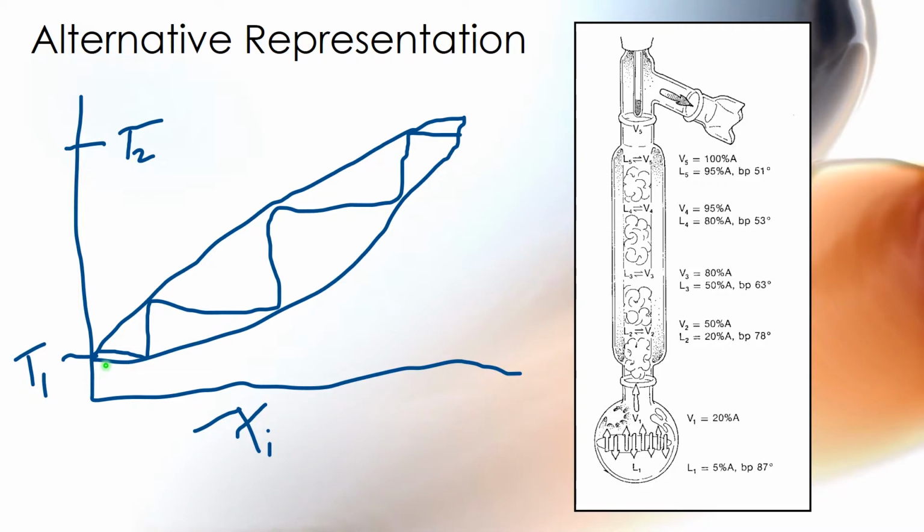Okay, so I threw this on here because some of you will want a different representation of what was going on with that graph that we talked about earlier. And if you look back at the graph with the theoretical plates that we drew in, this column here corresponds to theoretical plates at each level. So it shows you what's going on inside the column with relationship to this. And as you can see, it purifies the samples more as it goes towards the top of the column, and then they come over and they're condensed on the other side.